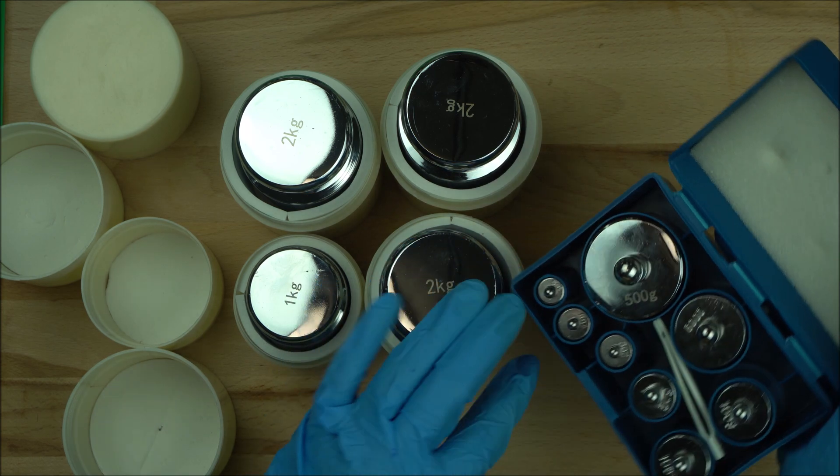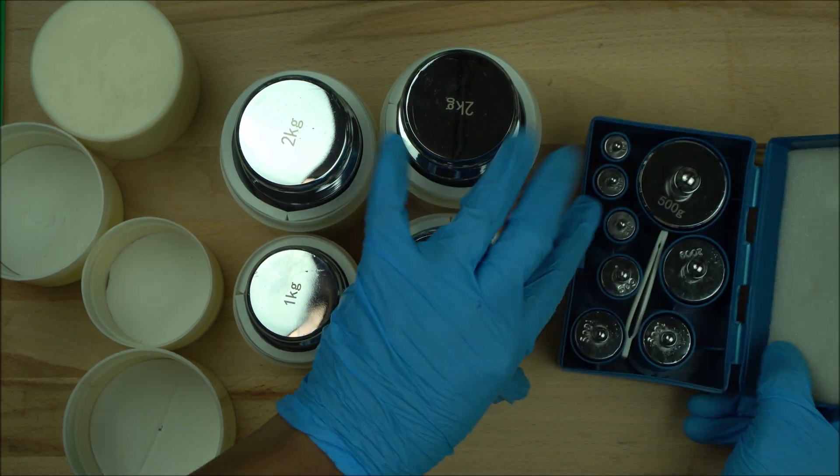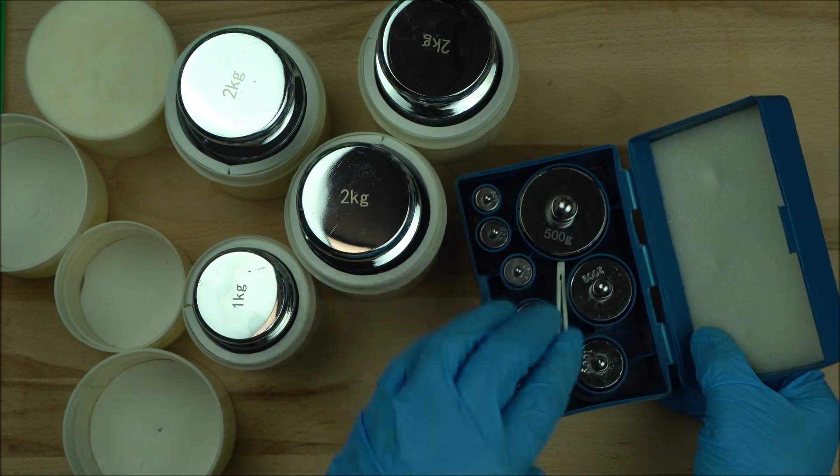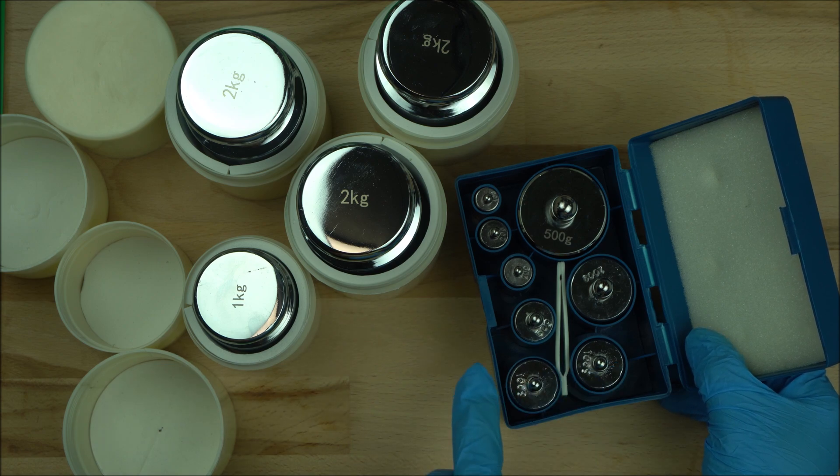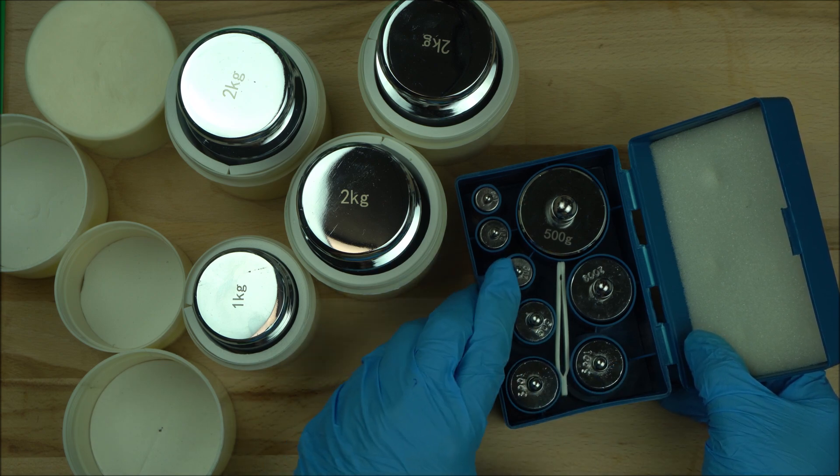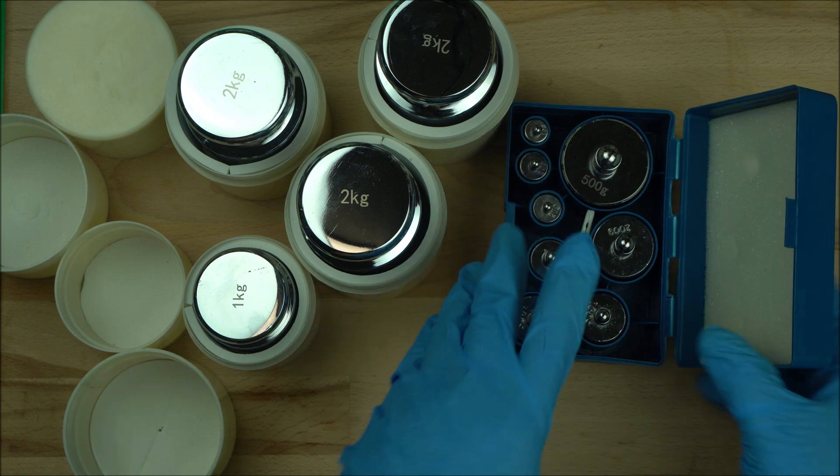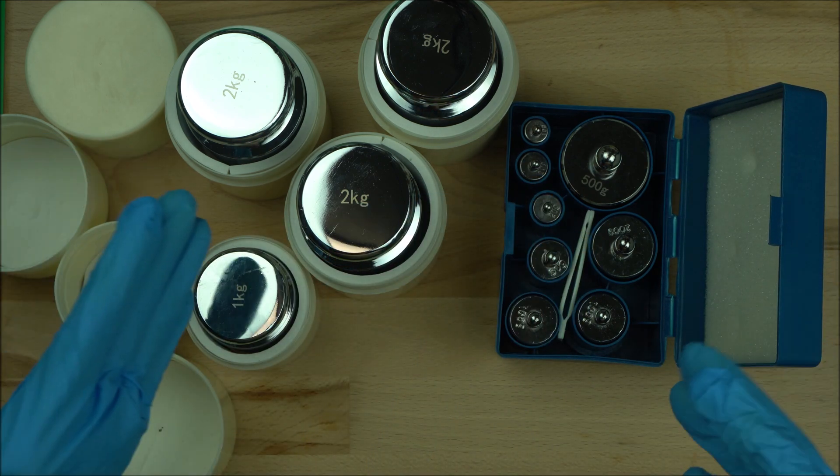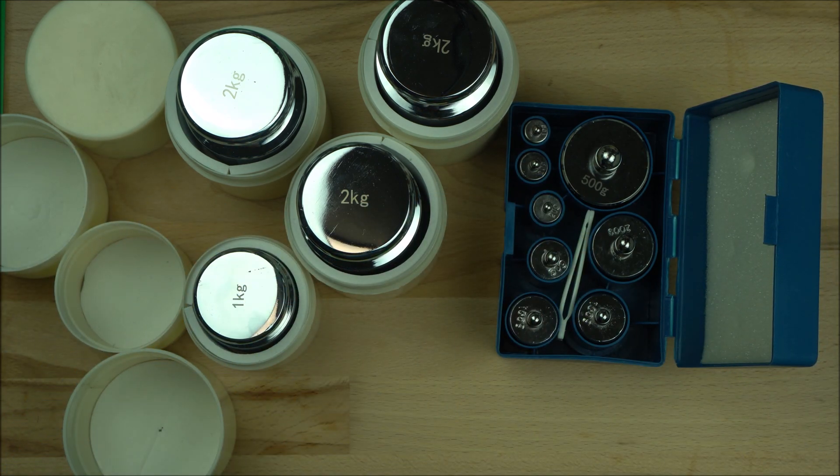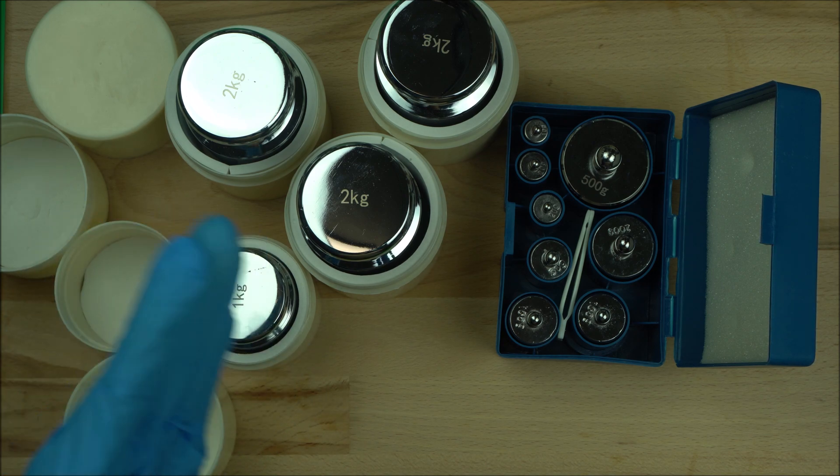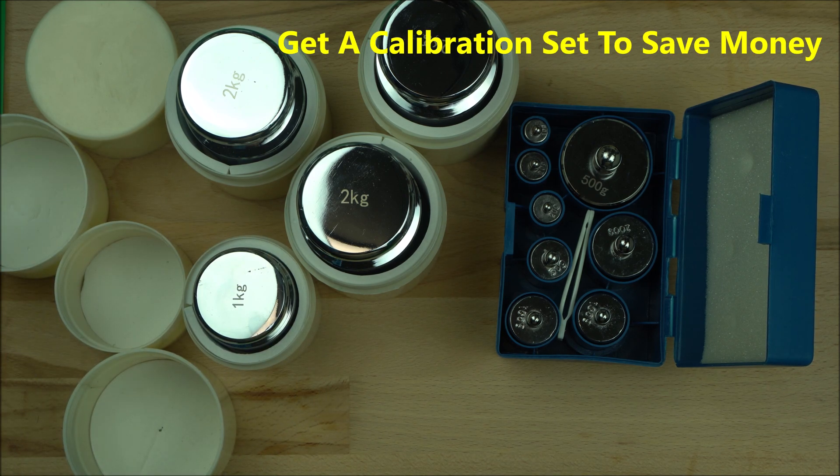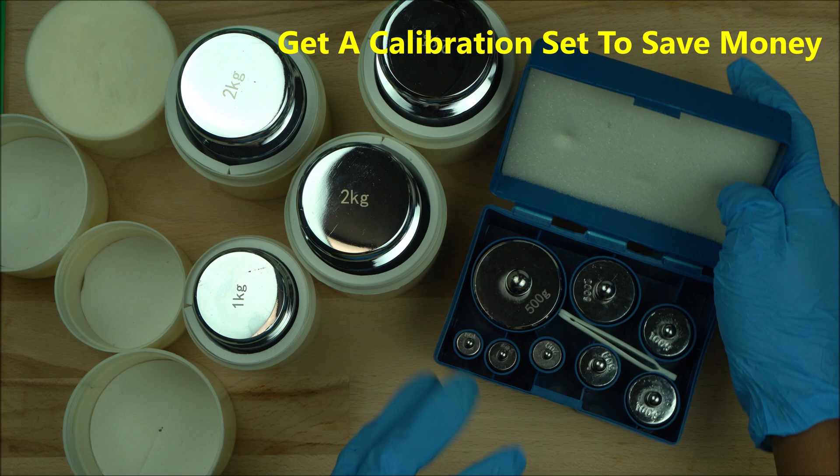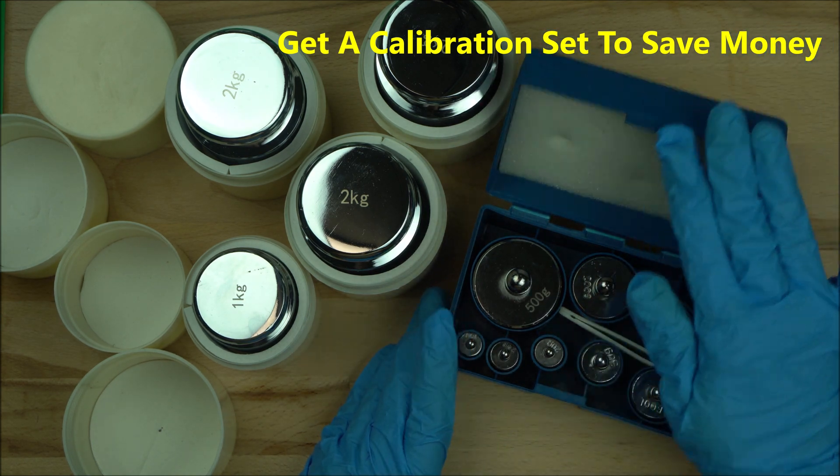If you have smaller scales, perhaps this is all you need. This scale set costs around eighteen to twenty-one dollars or something—amazing! So it's something you need if you have small scales. Because here I have 500 grams, 200 grams, 100 grams, another 100 grams, 50 grams, 20 grams, 20 grams, 10 grams. That's why you need one also.